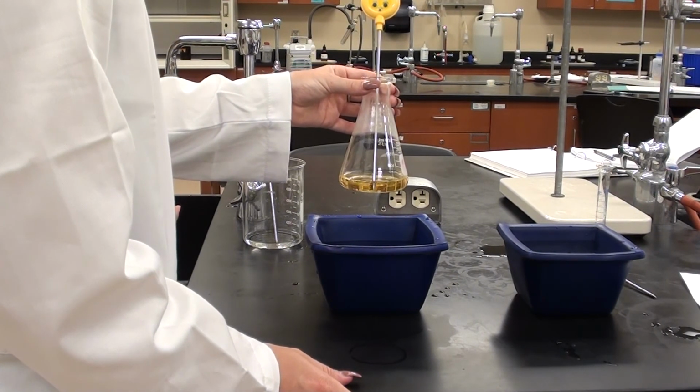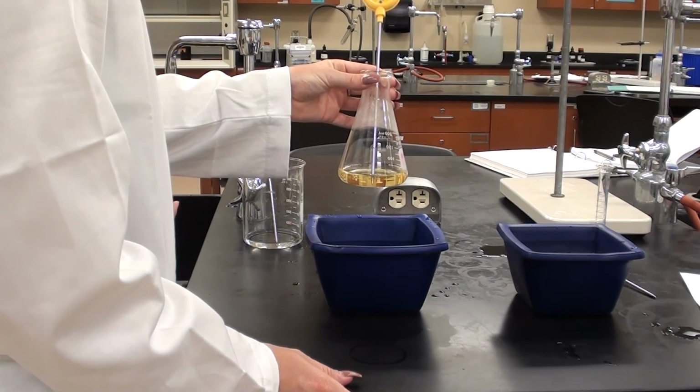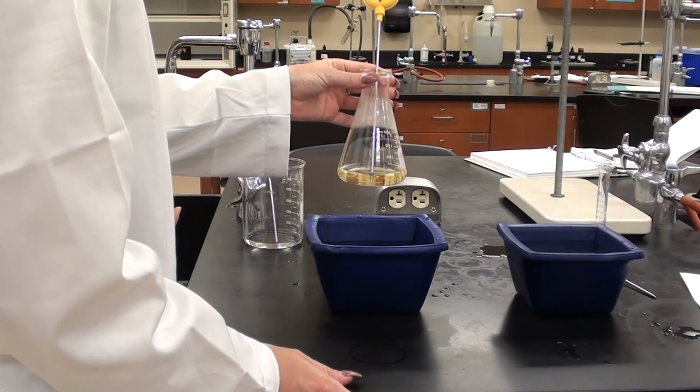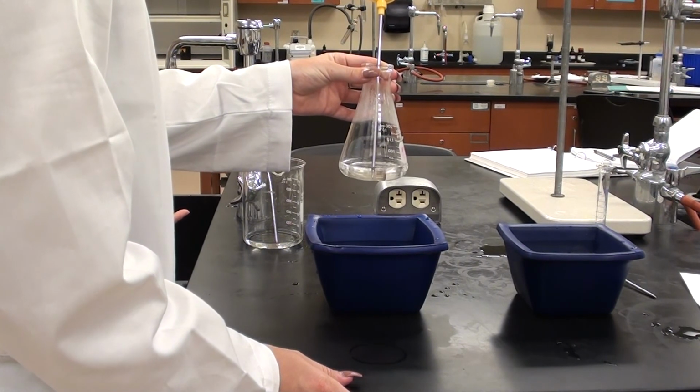As you can see, it's already beginning to change. So when it's hot, you'll see this reaction will go a lot faster. The cold one, however, will take a lot longer. So as you can see, that one's already changed. All right, thank you.